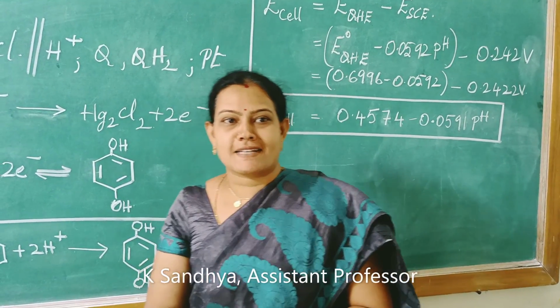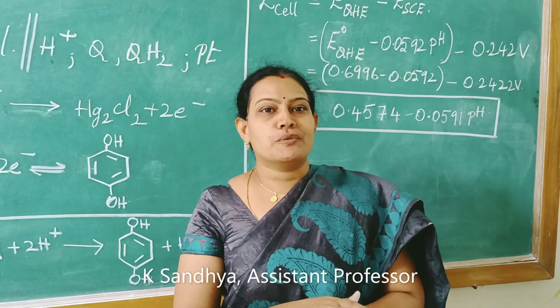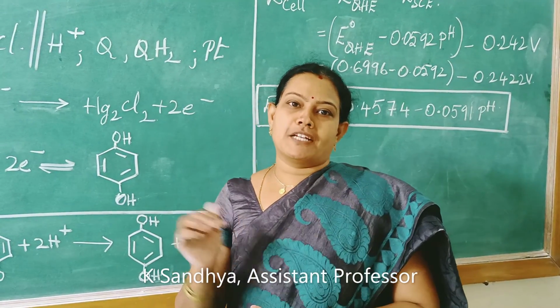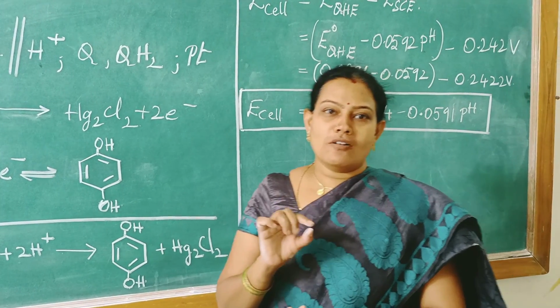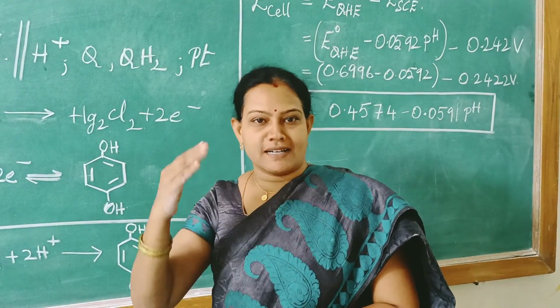Students, let's discuss how HCl is estimated using potentiometric titration today. Potentiometric titration involves the study of EMF values during the course of an acid-base titration.